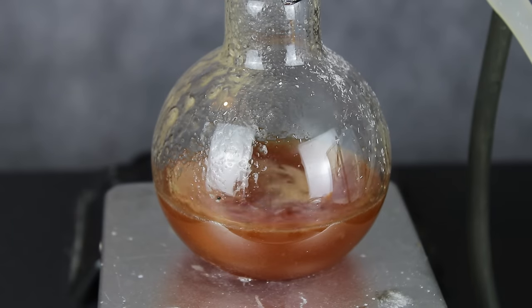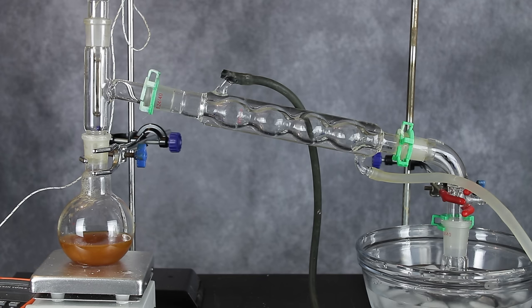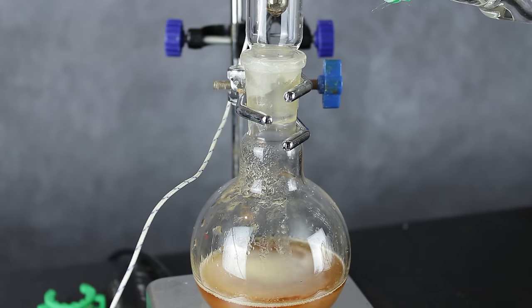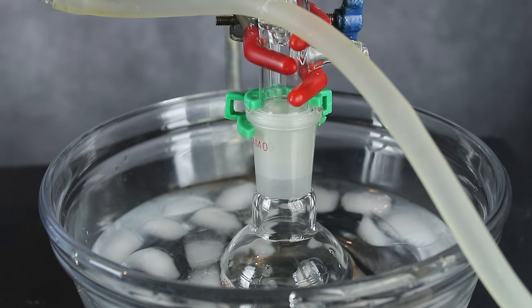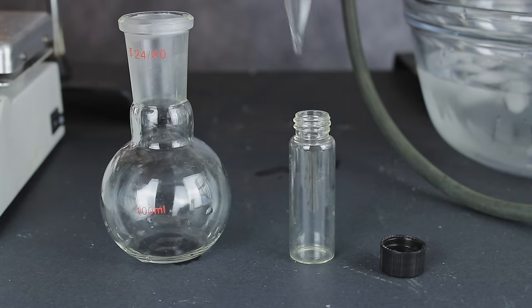Anyways, after about two hours, the reaction seemed mostly complete, so I reconfigured the setup for a distillation. Tert-butylamine boils at roughly 45 degrees celsius, so most of it came over in the initial fraction. I kept collecting the distillate until the temperature reached about 70 degrees, at which point the heat was turned off and the product was isolated.